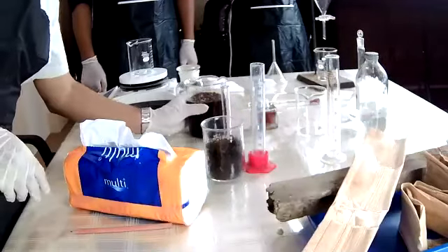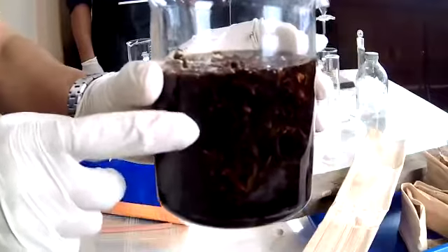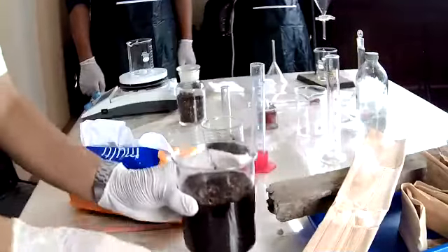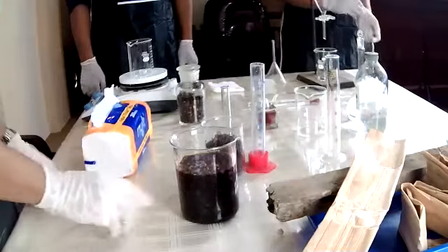And then we're going to soak this for about 24 hours. So you can see this is the liquid with the tobacco and also clove.